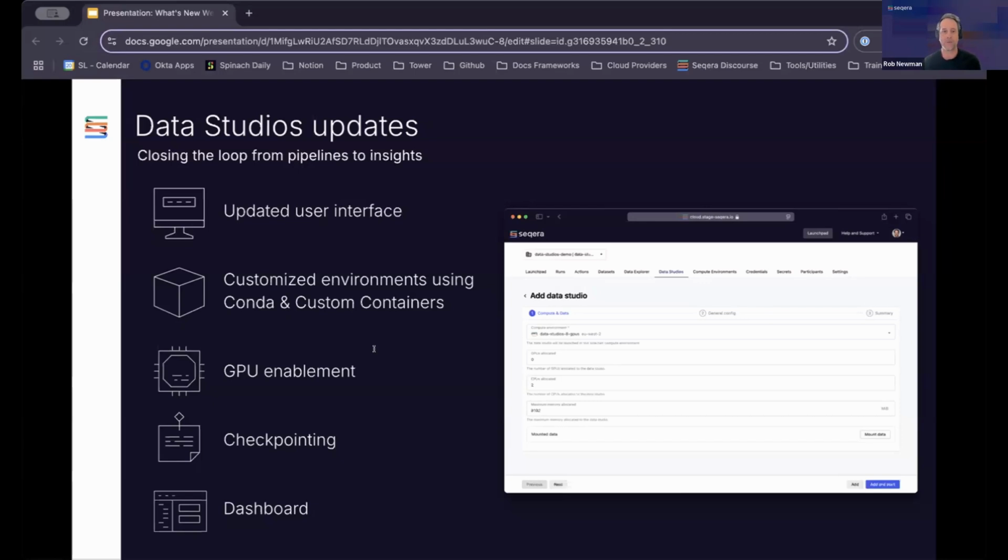Based on user feedback, we've also added a new add and start button that both creates and starts an analysis environment in one click. The loading page has also been improved with specific messaging that defines the various building and starting steps to ensure that the user is fully aware of all the progress as it's starting up.